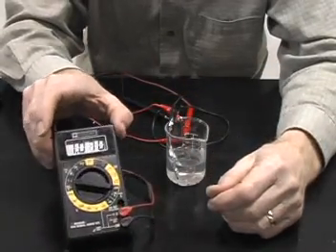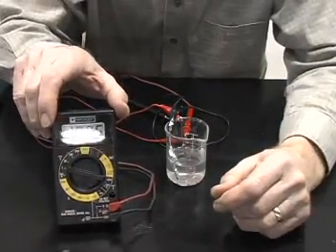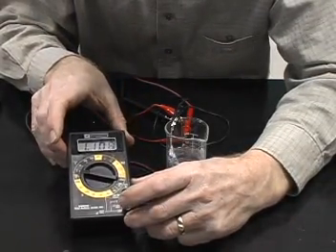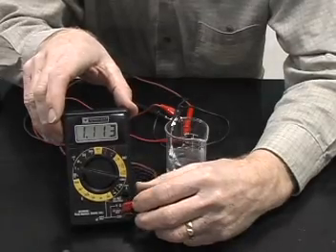And then we can measure the potential using the voltmeter, and we see that we get just over 1 volt, 1.1 volt or so.